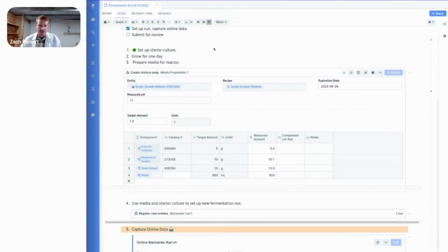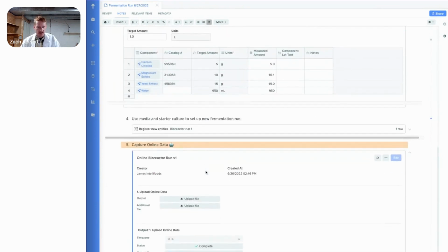So here in Benchling, again, I'm playing the role of my scientist at a company. I've just captured over 11,000 data points in my bioreactor run. And I'm concerned that now we have all this data in here. Is this really going to slow down Benchling? So what I'll do is I just want to make sure that my team can actually access this data.